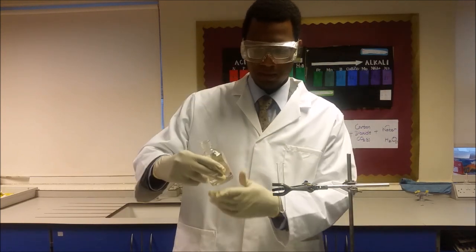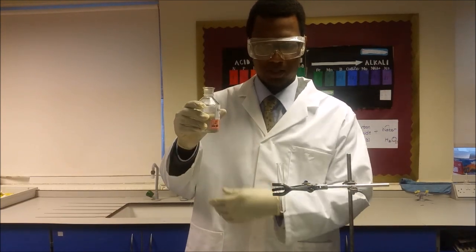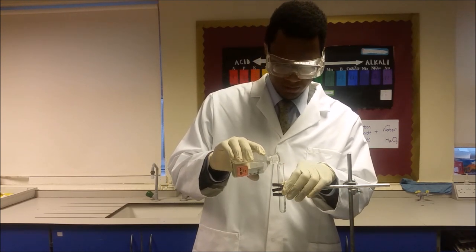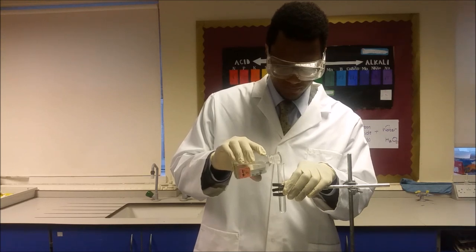The first thing you'll need to do is take your hydrochloric acid and fill it up to approximately two thirds of the test tube.